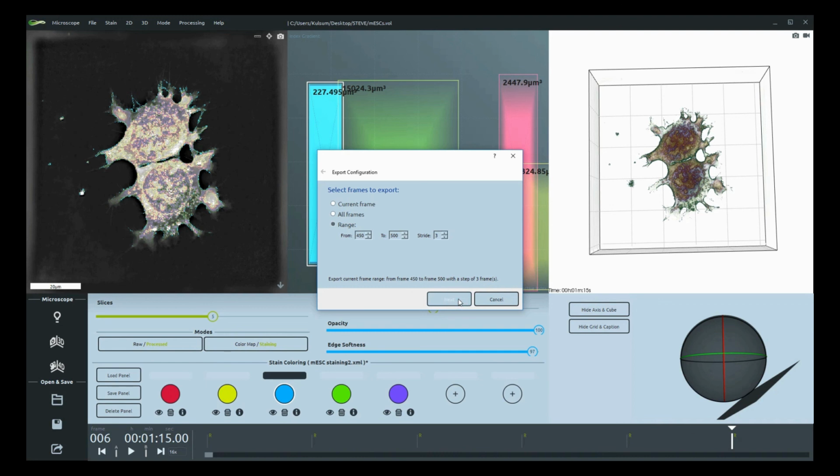You can then select which content you would like to export: the refractive index, an overlay of digital stains and fluorescence signal, for example, if you're working with fluorescence, or even a 3D rendering of the measured refractive index, as you can see in the top right panel. You can also select which slices you would like to export in the Z stack.